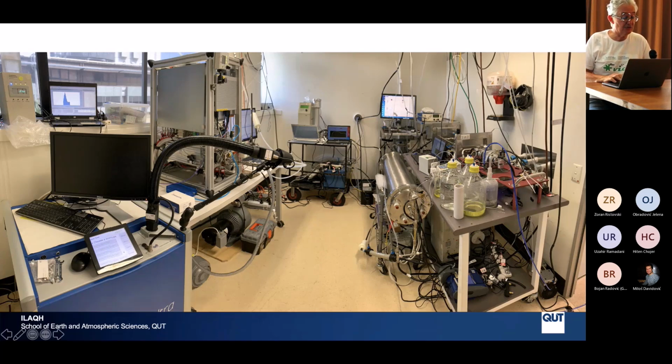It measures the hydrocarbon components, and we had the so-called CIMS. We won't go into these two quickly, and this one measures the oxygenated organic gas phase molecules. So we were looking at which molecules were the primary ones, which were oxygenated, and how many of those we would find in the particle phase.